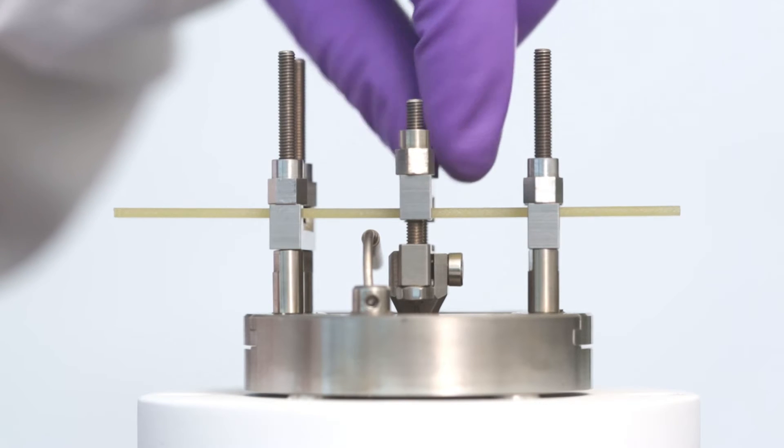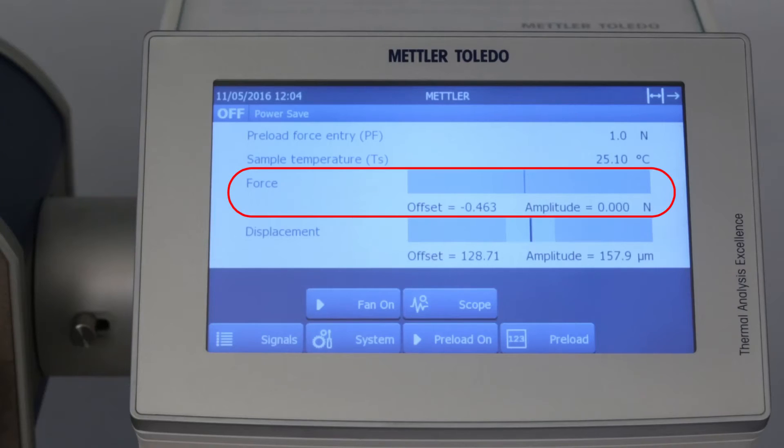Be careful not to cause unwanted force on the sample by tightening the nuts too much. You can check the force applied when tightening the central screws in the preparation dialog on the touch screen.